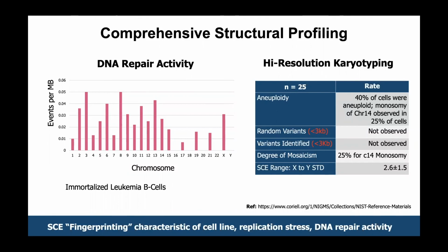Sister chromatid exchange events, shown on the left, are not true structural variants, as they self-correct during the next cell division. The rate of SCE events, however, is elevated in some cell types and can be indicative of cell stress and overall repair activity. These types of events are important process control metrics for cellular engineering, but are invisible to most measurements. We report them for every DGH analysis.